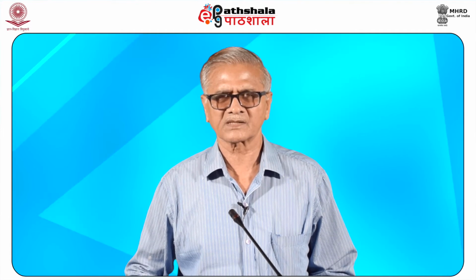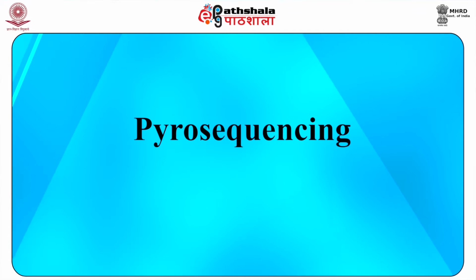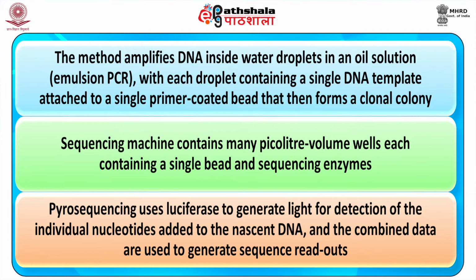Some of the second generation sequencing techniques are pyrosequencing. In this method, the DNA is amplified inside water droplets in an oil solution, which is called emulsion PCR, with each droplet containing a single DNA template attached to a single primer coated bead that then forms a clonal colony.